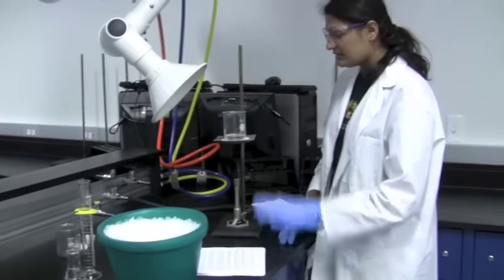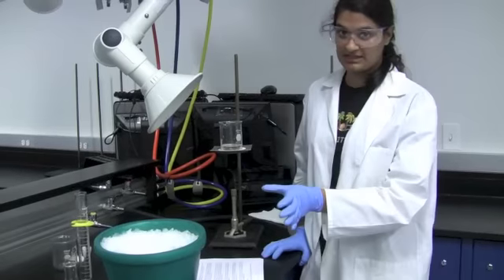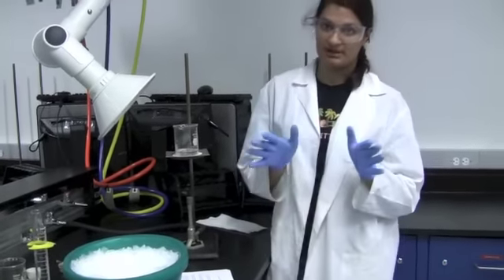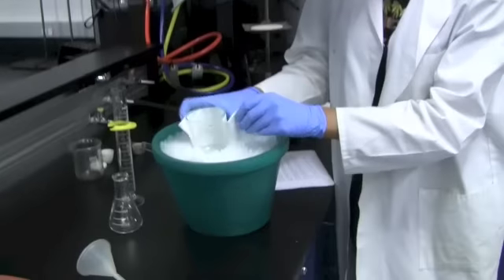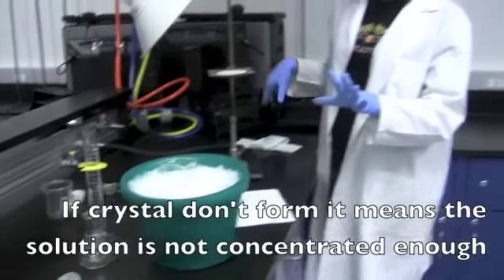And now you're going to want to take the clear solution, turn off your Bunsen burner, take the clear solution and add it to an ice bath. However, you never want to directly take your beaker from the Bunsen burner to the ice bath. You want to wait about a minute for it to cool. Once it's cool, you're going to take it, place it inside the ice bath, and make sure that you keep it as motionless as possible.